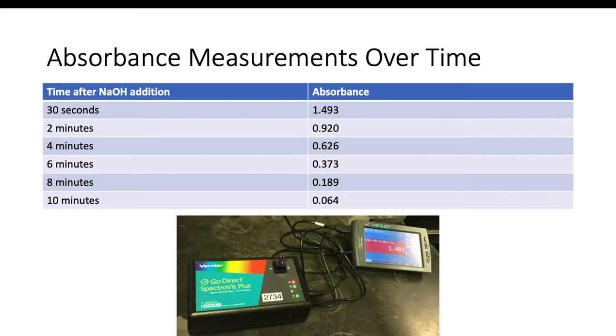What the spectrophotometer does is it takes light and shines it through your sample, and it measures how much light gets through. The more light that gets through, the lower the absorbance, and the less light that gets through, the higher the absorbance. For compounds that have very intense color, like crystal violet, you can relate this absorbance to concentration through something called Beer's law, which, if you've done that experiment, basically says those two things are linearly related. As concentration goes up, so does absorbance, by the same multiple. Like if concentration doubles, so does absorbance.